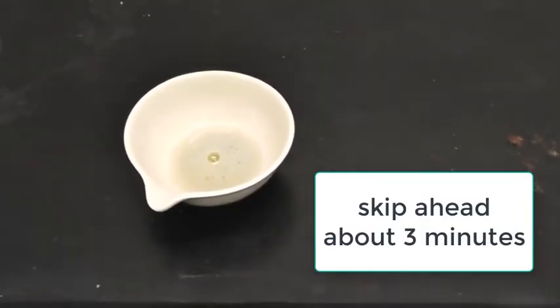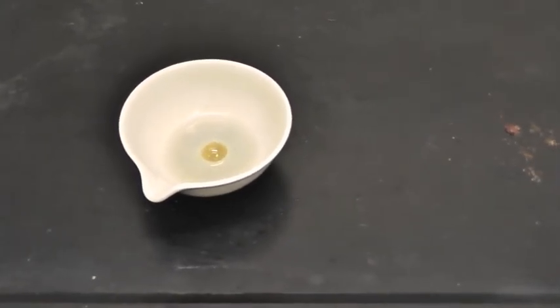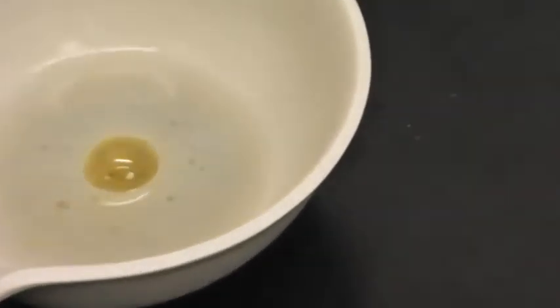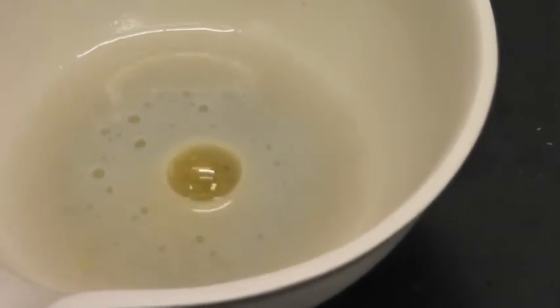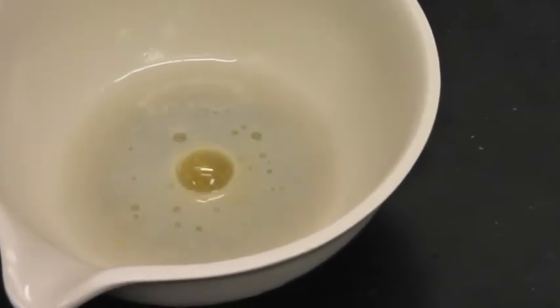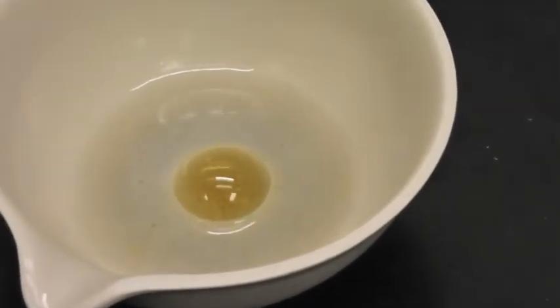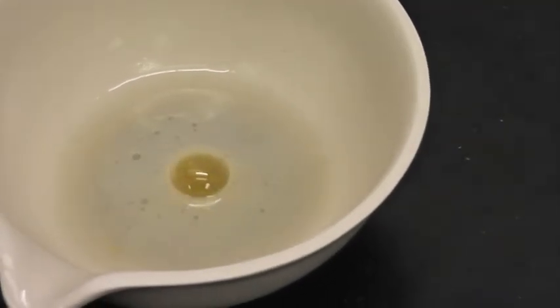All right, so we'll come back in the middle of the process, but you see these bubbles forming? And inside the bubble there's that orangish gas. That is basically little smog bubbles. As that big bubble forms, smaller gas molecules evaporate into that big bubble, which gives us the brown color. And it is still reacting pretty good, so I'm going to pause it again, and we'll come back when it's done and move on to the next step.